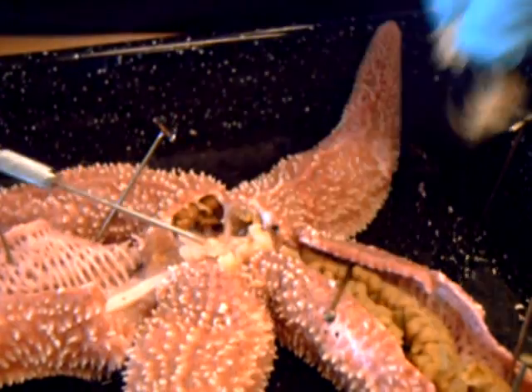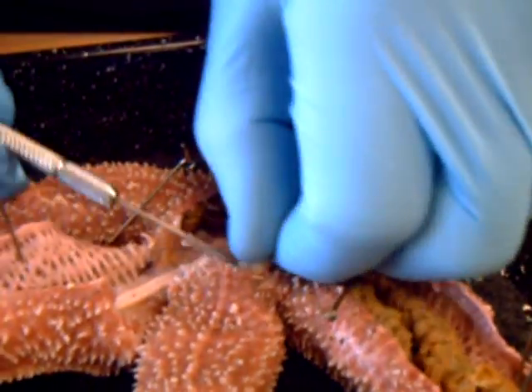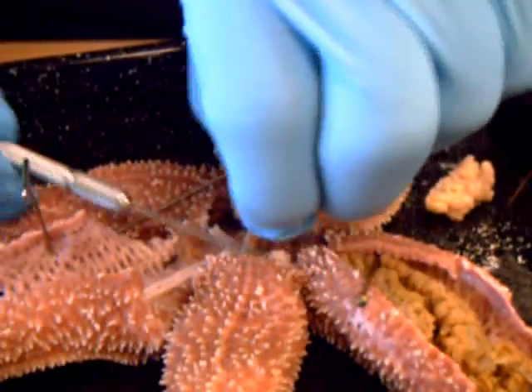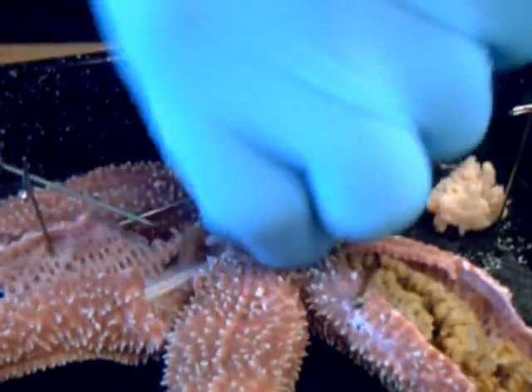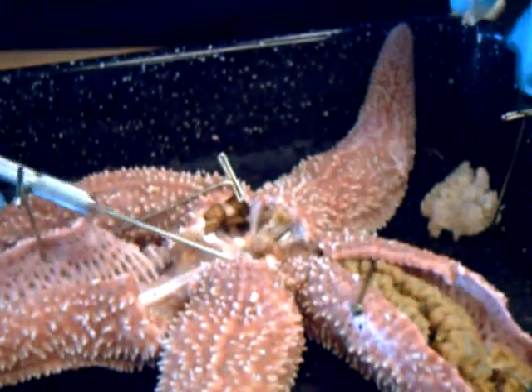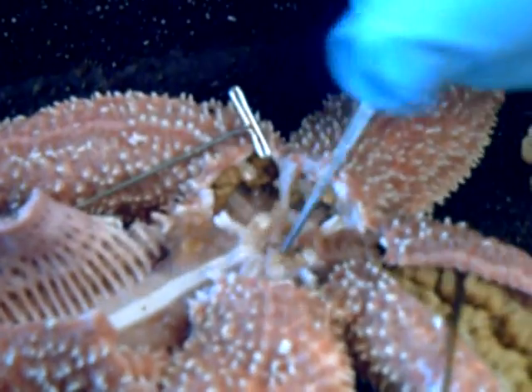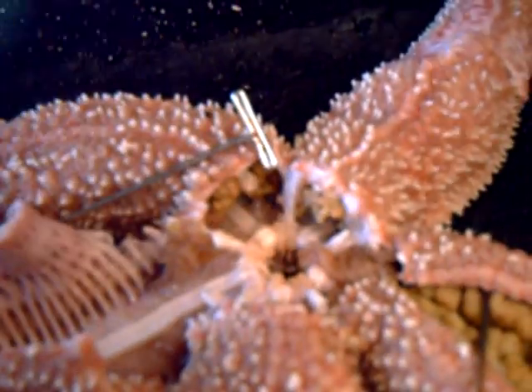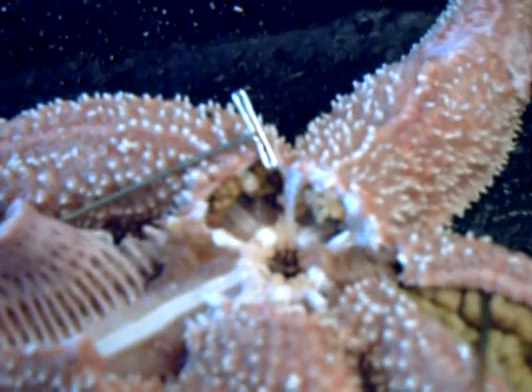We're just gonna unscientifically pull that out. See the stone canal? Still in there. And then, so that's all out. And then you go further.